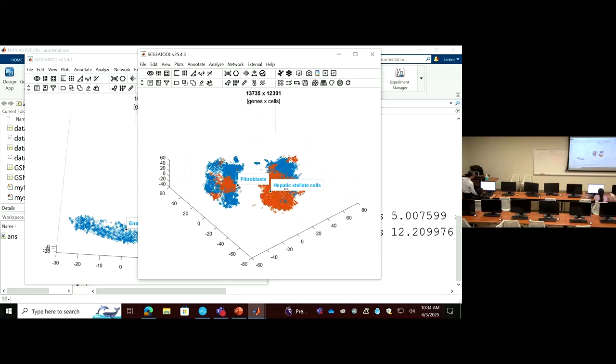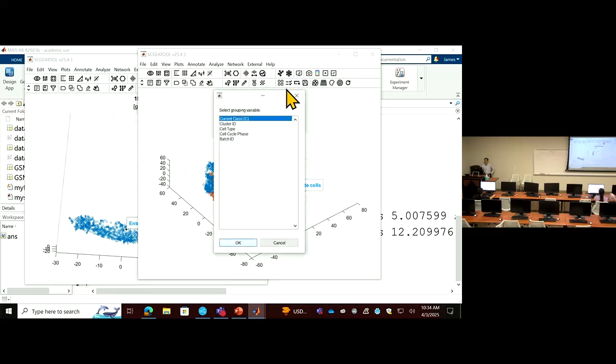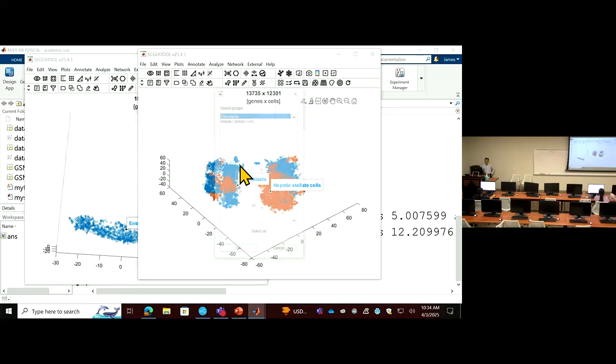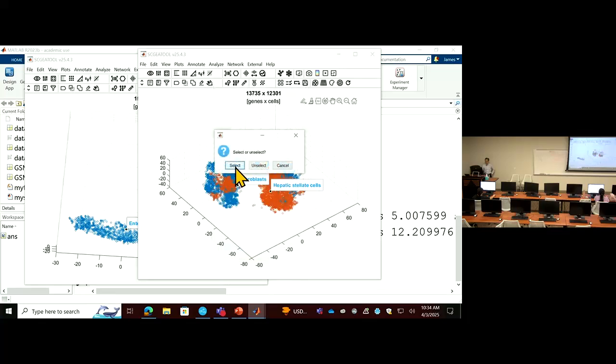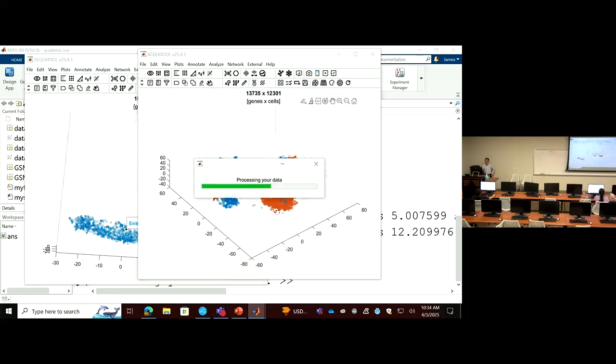Can you rotate the C2 samples? Click this button here. Okay. Oh. Yeah. So you got it. Thank you. Yeah. So if you are working on the fibroblast examples, we can extract fibroblast in the same way. To select this, to select fibroblast, and click select.